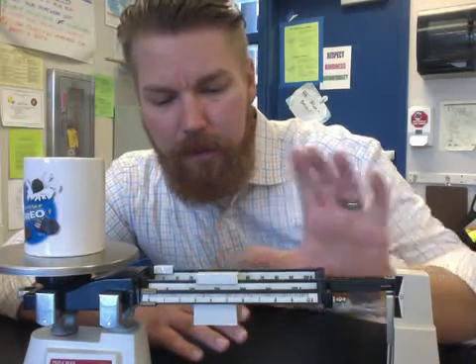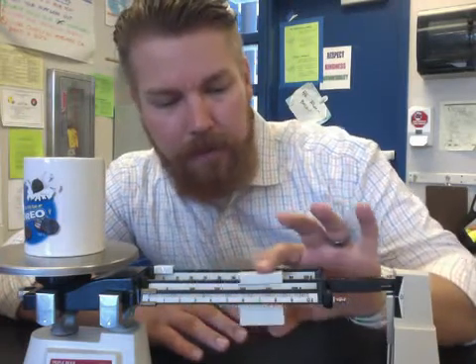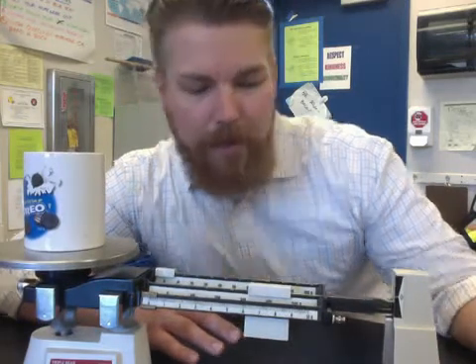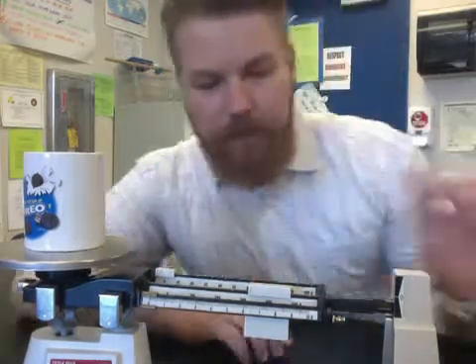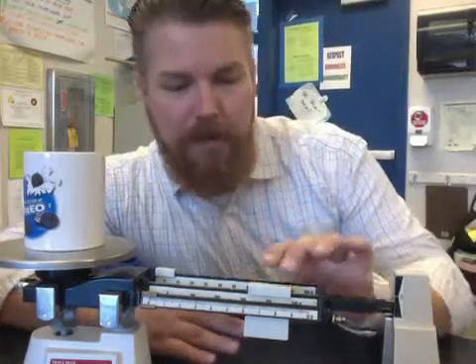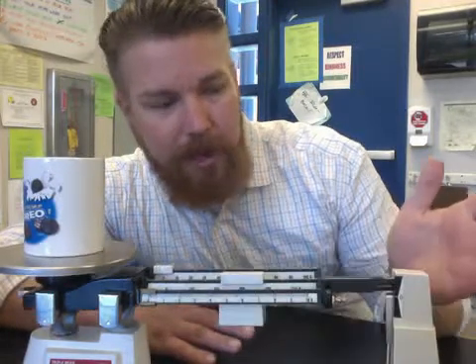Keep moving the 100-gram weight over and let it fall into each notch. It landed at 400 grams, so you know it's not 400 grams — it's less than that. Pull it back to the 300, let it sit in the notch, and the arm goes back up.